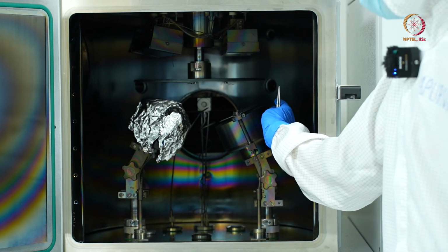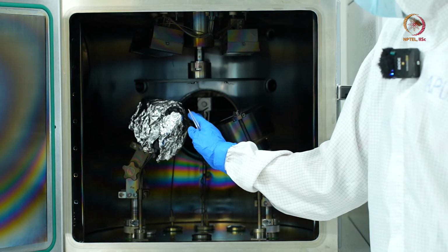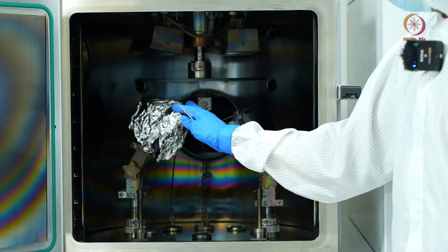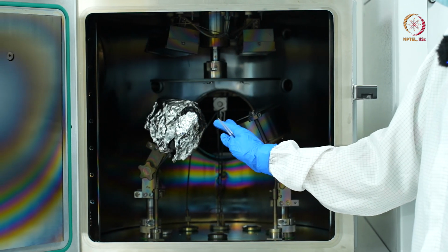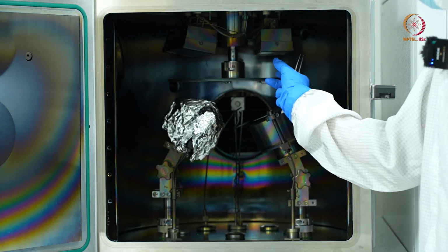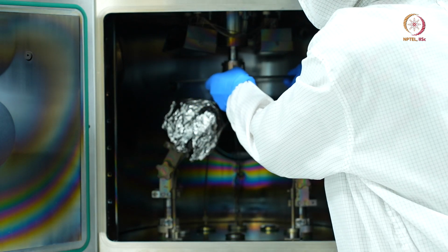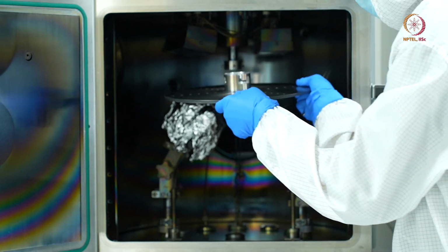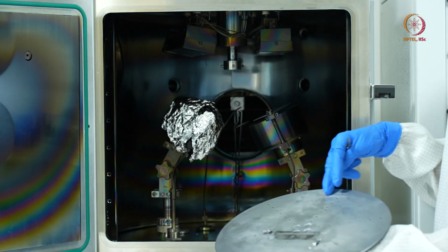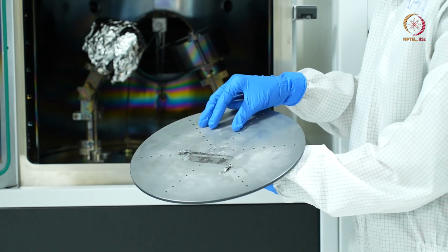We have placed our target here, and we have covered the RF sputtering magnetron with aluminium foil so as to eliminate any contamination while the tungsten is getting deposited. This is the substrate holder, and I can remove it. So this is the substrate holder, and we can place our substrate onto it.